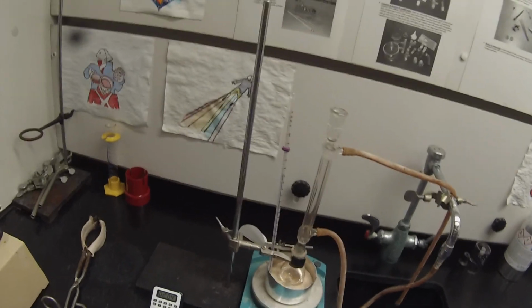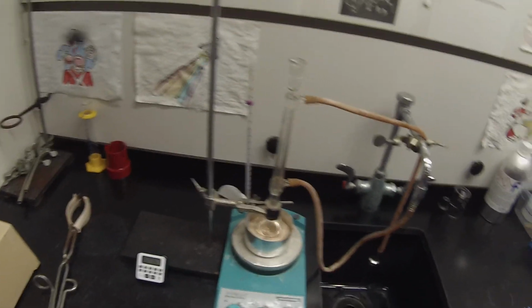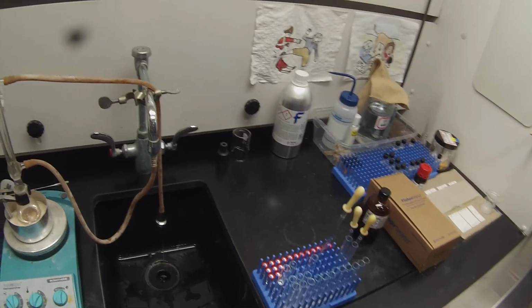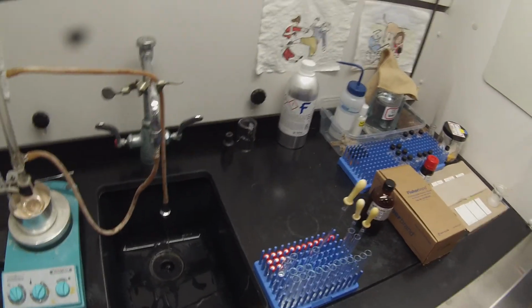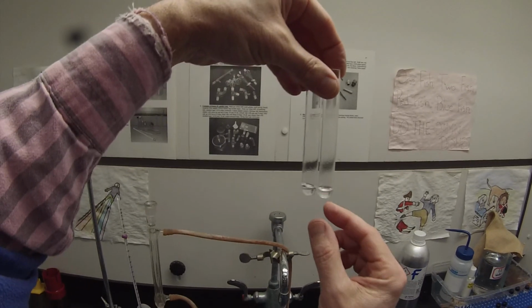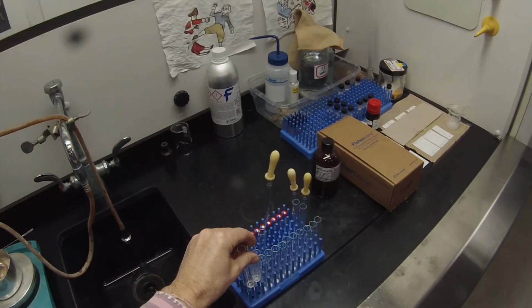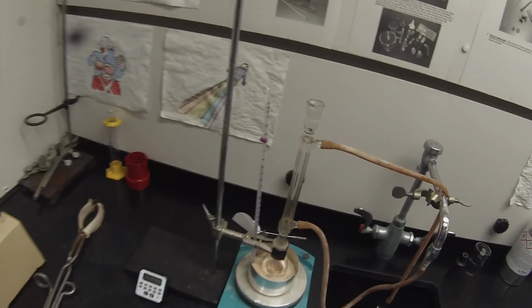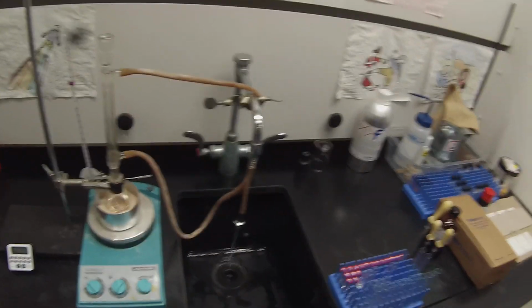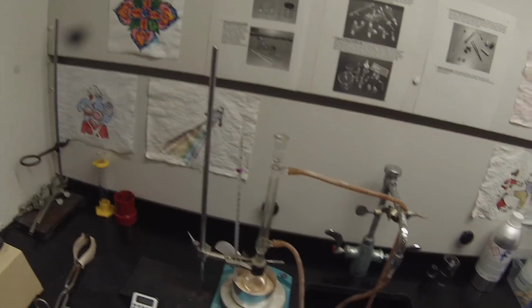It's a little unreliable. My thermometer is now up to about 153, so I'm lowering this just a little bit. I did accidentally turn that when I was trying to set up the spinning. You'll see that these two have settled pretty well, so I may not need to centrifuge them. But as the reaction proceeds, it will probably turn color, and it's likely that the later fractions will not settle quite as nicely.